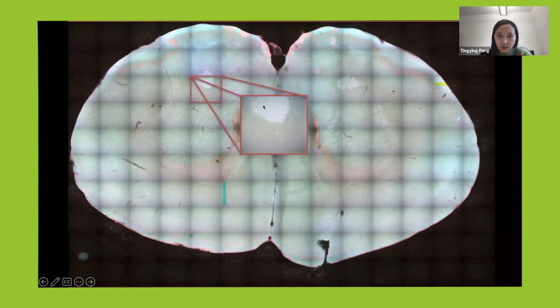This is of course because, in each patch, the microscope is only focused on one part of the specimen, because the specimen itself is too large to fit into the field of view. So for each patch, the illumination is strong in the center and weak in the corner. Then when you stitch them together, you get these grids.